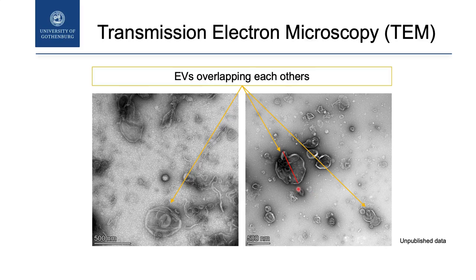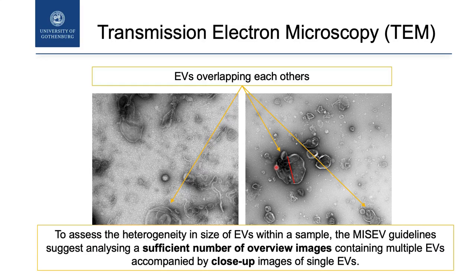I can calculate these diameters, but probably it's not true because here I have another vesicle. Or maybe I can look at these diameters, but I don't know exactly where the limit of these vesicles is. We have to keep in mind that there is a problem. Still, transmission electron microscopy and the negative stain technique can be used to look at the size of vesicles. But following the MISEV guidelines, to look at size we have to show a sufficient number of overview images as well as close-up images to really show what we have.